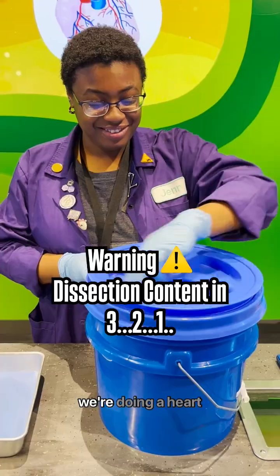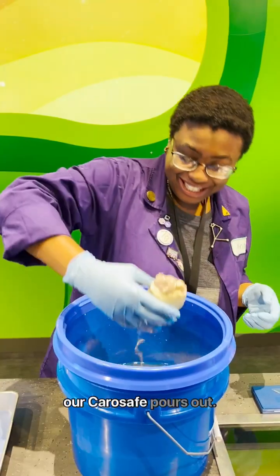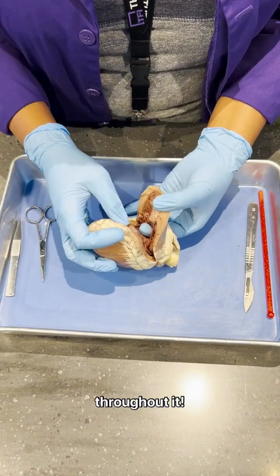Hi everyone, this is Jen and today we're doing a heart dissection. Our hearts are preserved in Carosafe and we're going to flip the heart upside down as our Carosafe pours out. This lets us know that the heart is hollow inside, which is good because blood is in our heart and going throughout it.